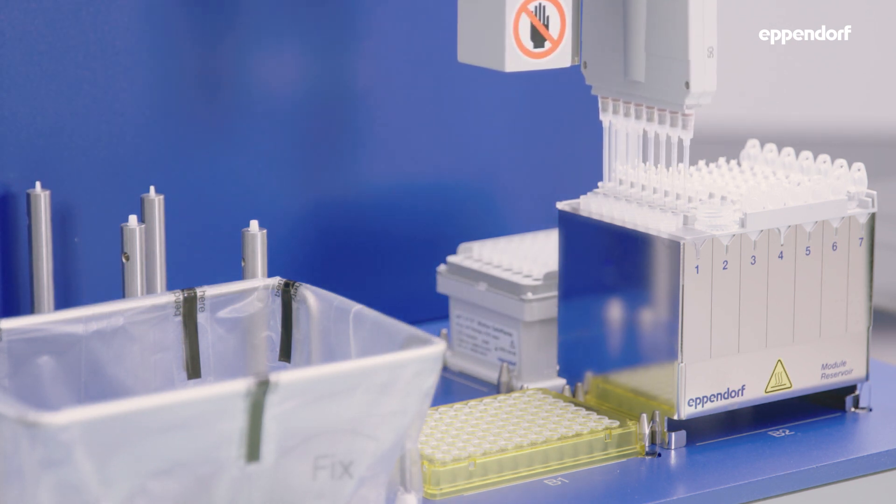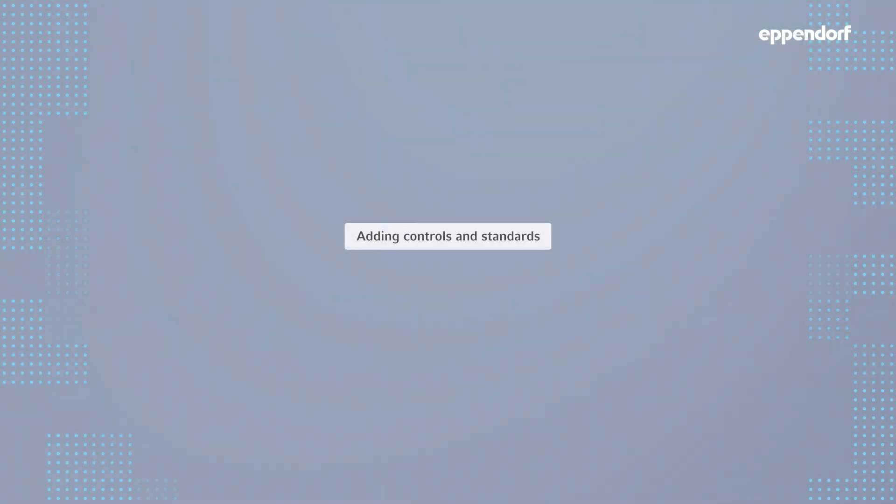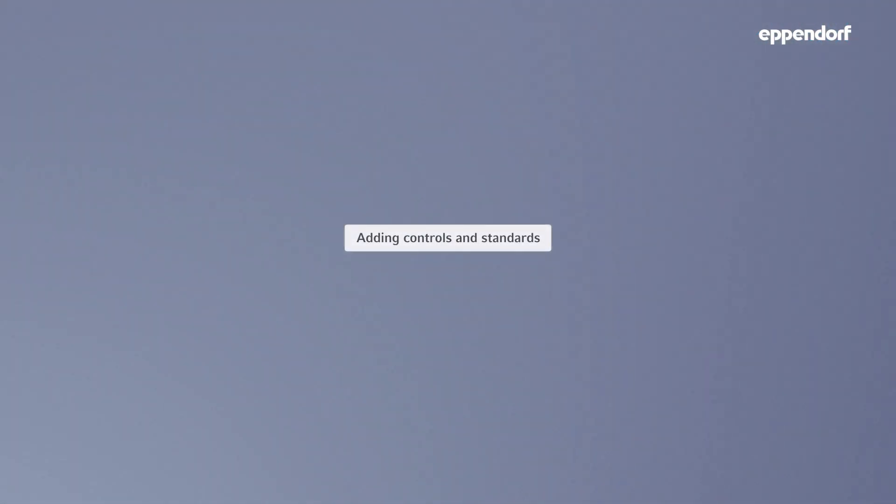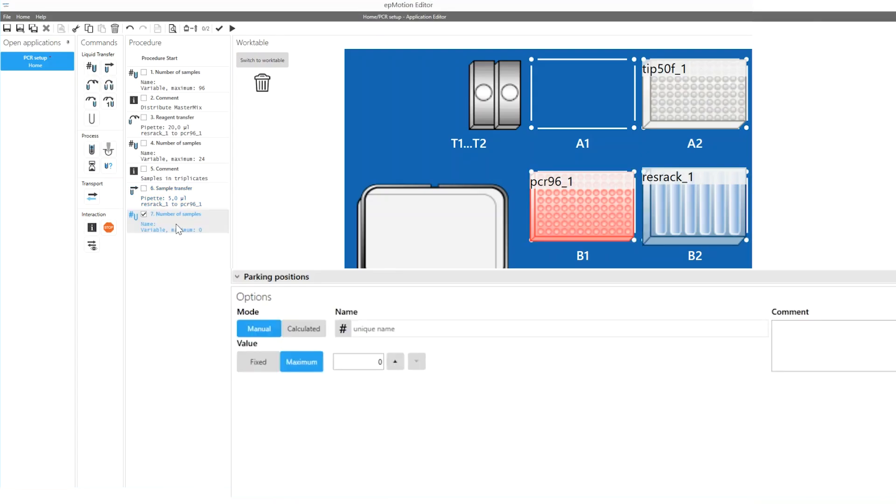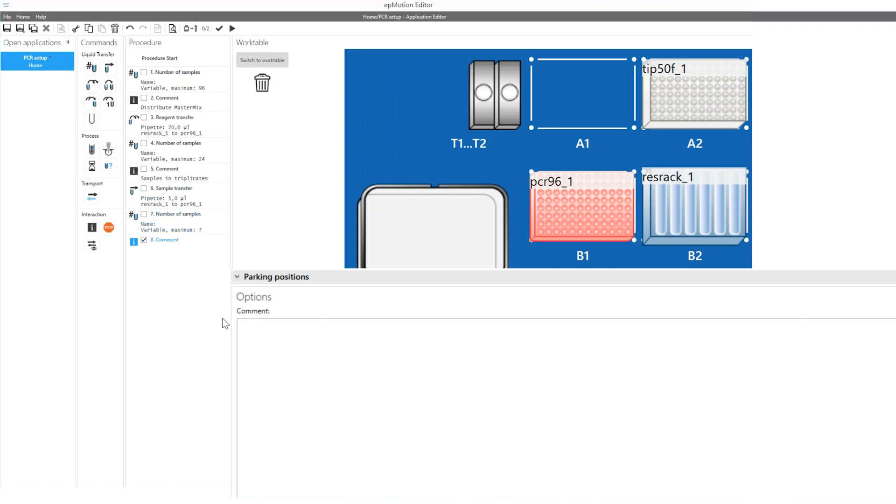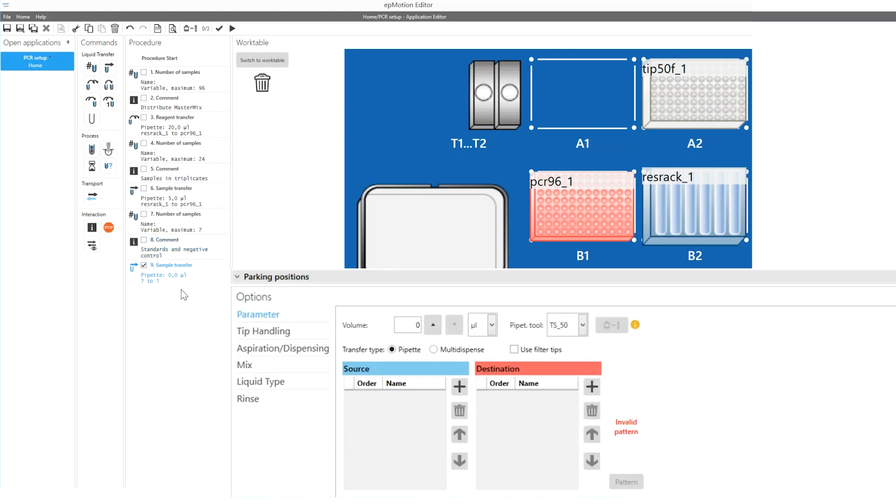Finally, standards and controls can be added to the PCR plate. In this example, six standards plus one negative control are used. A sample transfer command is again conducted to perform the liquid transfer from the source vessels to the desired vessels of the PCR plate.